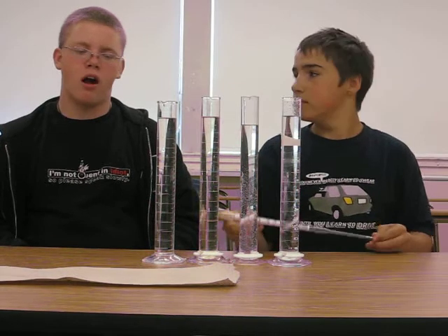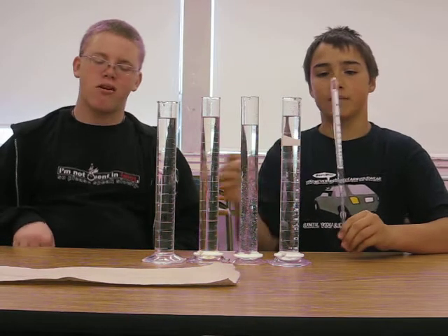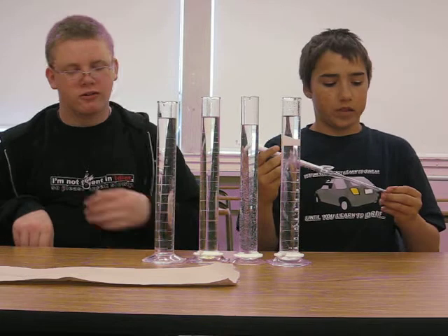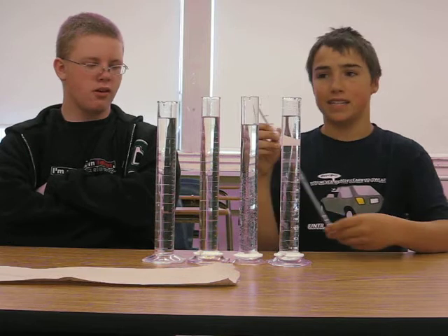Hi, I'm Justin. And I'm Eric. Today we're teaching you about a hydrometer and density. The hydrometer is a thermometer-like thing, but it tells us density instead.